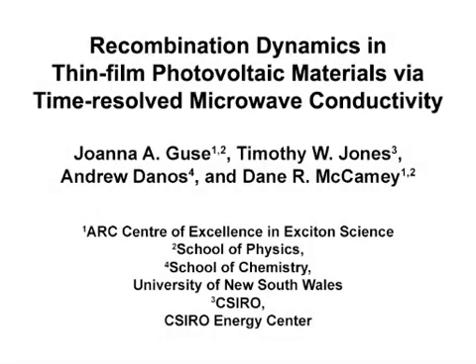The overall goal of this experiment is to use reflected microwave power to measure the recombination dynamics of photo-induced charge carriers in thin-film photovoltaic materials. This method is useful in the field of photovoltaics because it measures photo-induced charge carrier decay via trap states and band-to-band recombination processes. The main advantage of this technique is that it doesn't require electrical contacts to the sample. This means that the measured lifetimes and conductivities are not distorted by the presence of cathodes.